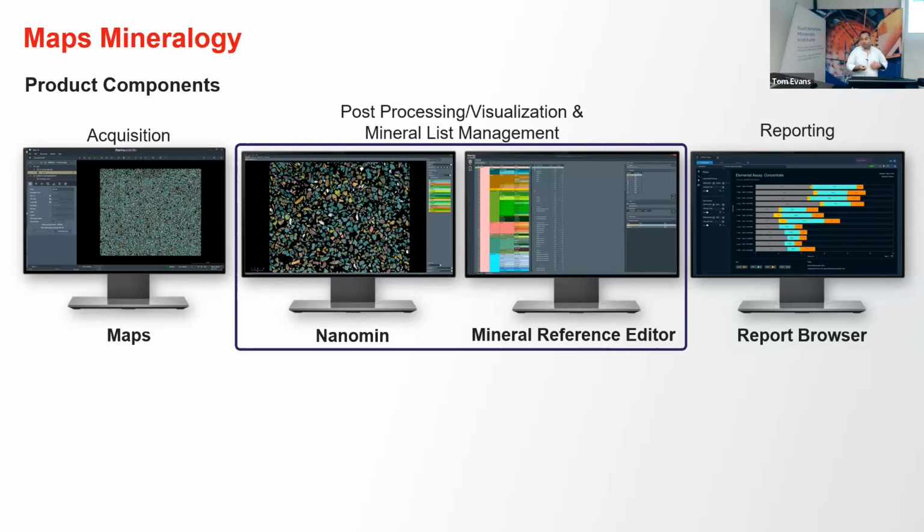So that's why in the acquisition software, you can set up all the automation, acquiring all the individual fields to cover very large areas, but also do it at high resolution. And then at the end of the acquisition, the data is processed and analyzed. All the X-ray information gets analyzed. I'm going to touch base on that later on, using a library. So we're going to be doing a spectrum matching with the library. And then the software will give you all the information about what the minerals in the sample are and what the proportion of the minerals is, and the elemental quantification. And then the reporting is probably what we are most used to with MLA and QEMSCAN. You get, for example, a liberation report or a grain size or particle size report.